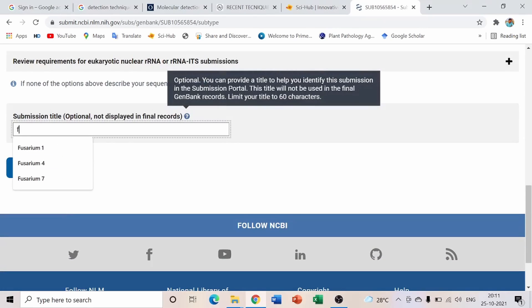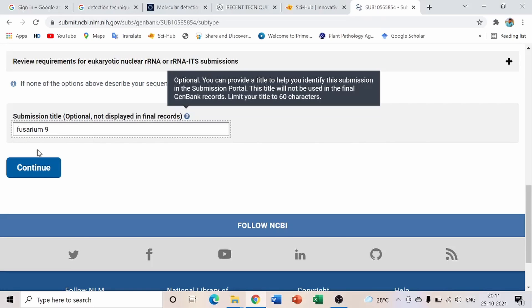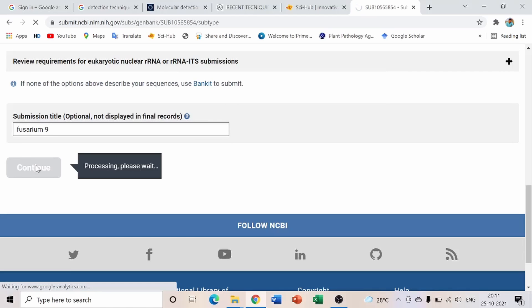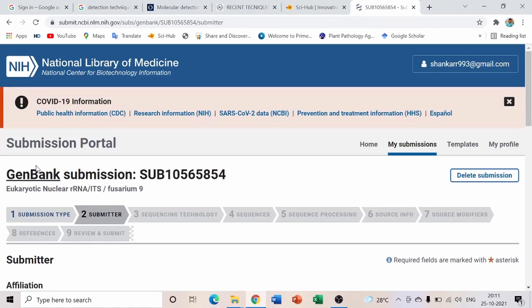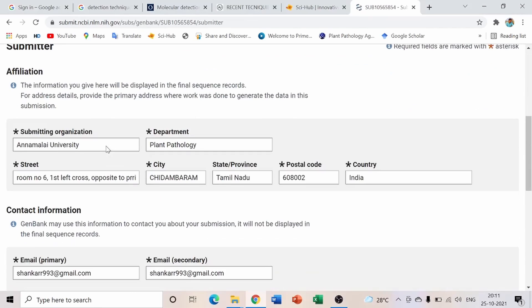You don't need to worry about the submission name field, as it won't appear in your data. Simply enter the isolate identifier — for example, since I am submitting my ninth isolate, I am entering 'Fusarium 9.' Then click Continue.